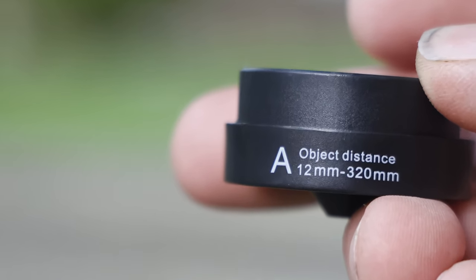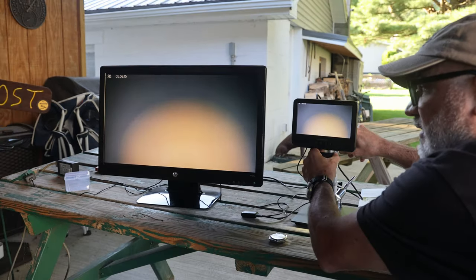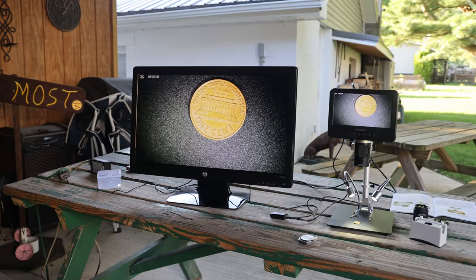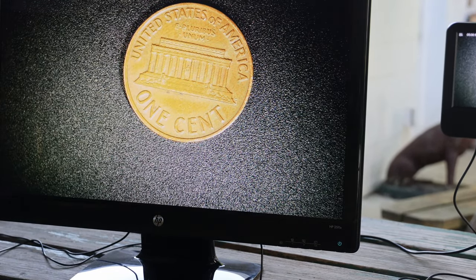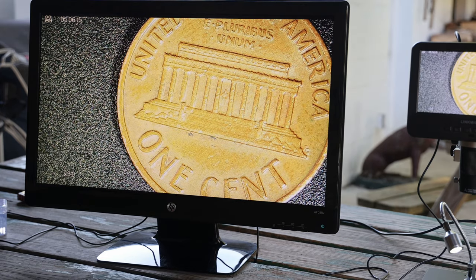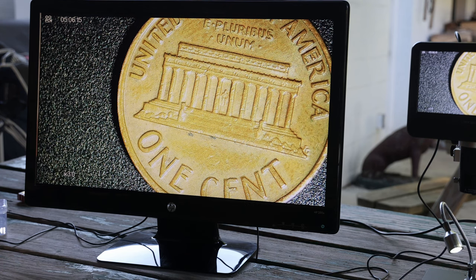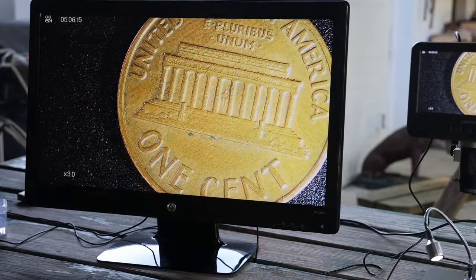The next test was using the 12-320mm lens, which would be the A lens. I'm using trial and error to find the sweet spot to get the coin in frame, then focusing. This one you have the most leeway with. That's a pretty clear picture. Using the digital zoom to get it a little more centered — it's a pretty nice picture. You can also use the gooseneck to create shadows on the grooves to give a little more definition. That's all personal taste. It's showing you the details and looking pretty good.